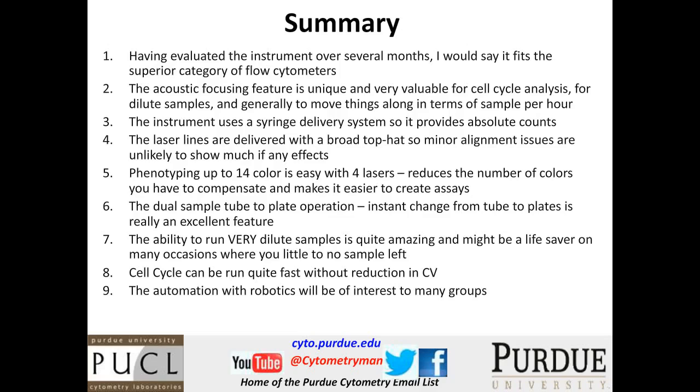The other thing that I didn't spend any time on in this seminar, but I'll mention it briefly now, is that you can run incredibly dilute samples. I heard a story that Greg told me that someone had dropped a sample on the floor and there was almost nothing left in the sample. Greg said to the scientist, oh, look, just put some saline in there and we'll run the sample. And they did, and they got great data out of it. The reason is you can run that volume through the system in a reasonable time, and by the combination of acoustic and hydrodynamic focusing, you're going to get excellent quality data on very few cells.